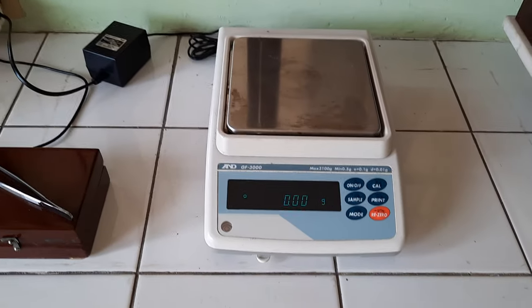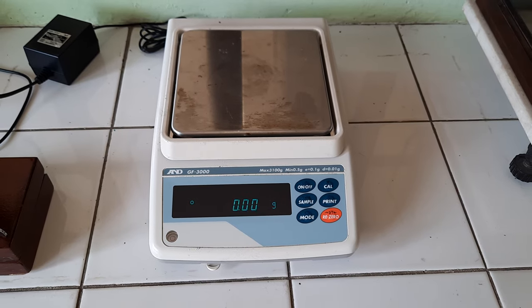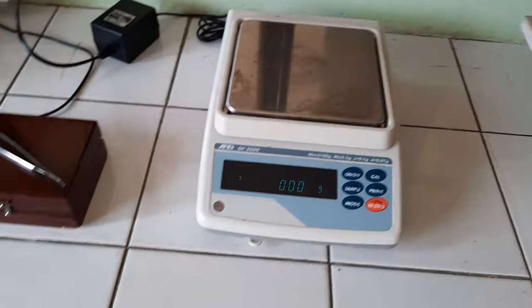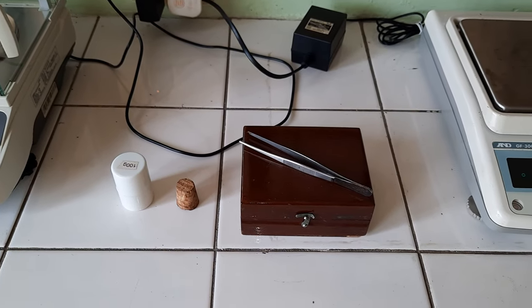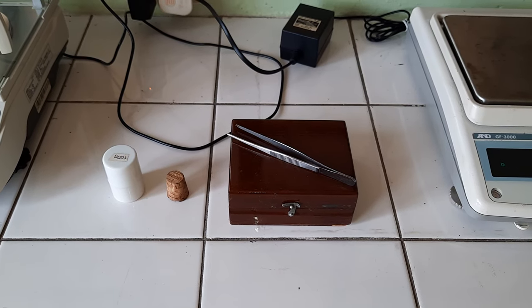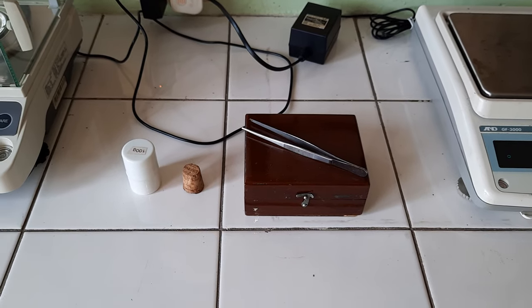First we have the tabletop electronic balance, which can measure up to a hundredth of a gram. We have here our set of weights that we use during calibration and other measurement verification protocols or procedures prior to our routine use of these electronic balances.